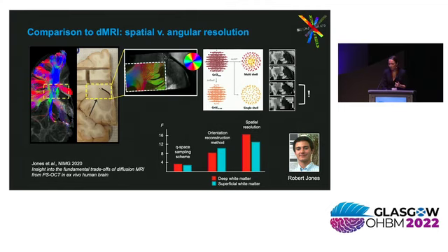At the moment, we can only apply PSOCT to small fields of view, small samples. So we honed in on one of those problem areas where a bunch of fibers branch and cross, following up on the findings of the tracer studies. This is a branch point between the internal and the external capsule.